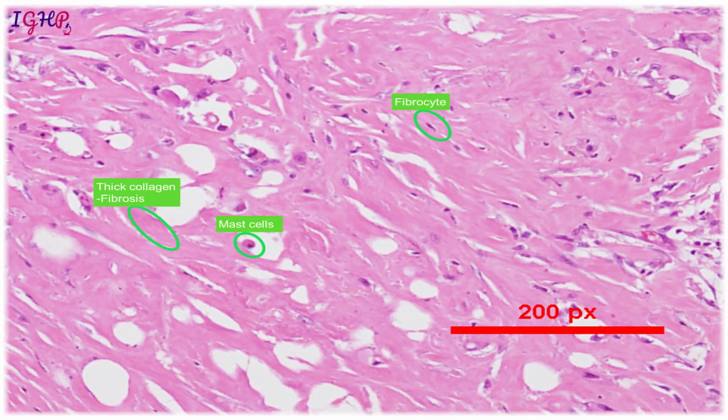Now again, if you see here, this area is showing you a lot of eosinophilic bands, and you see very sparsely scattered cells. If you look carefully, these are again all collagen fibers, and this is more an area of fibrosis. So when there is more collagen fiber, we say it is fibrosis, and when the collagen fibers become very dense and the tissue becomes hard, then we call it sclerosis. So it is just one and the same terminology. It is only on the appearance that we say sclerosis when it is becoming hard, and fibrosis when we are seeing an increased amount of collagen fibers.